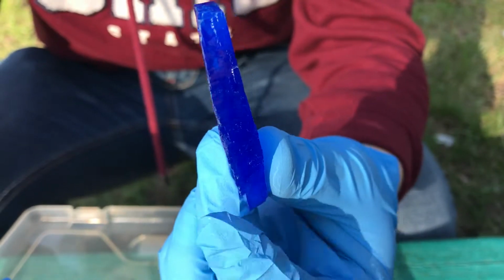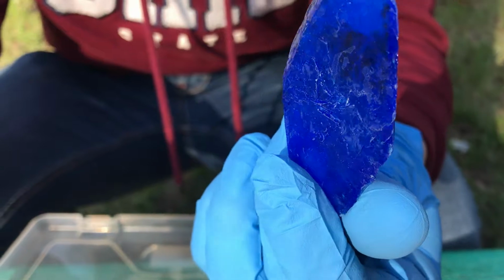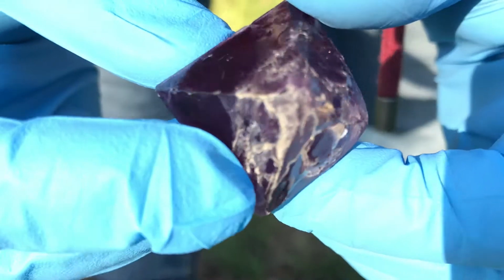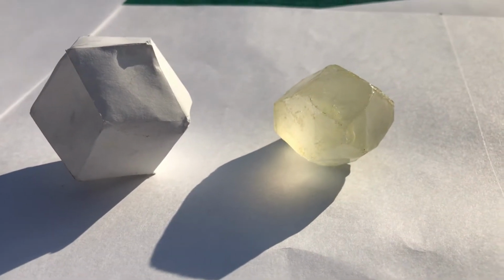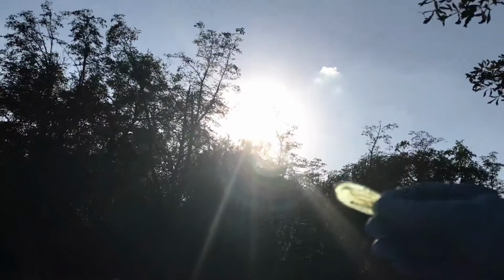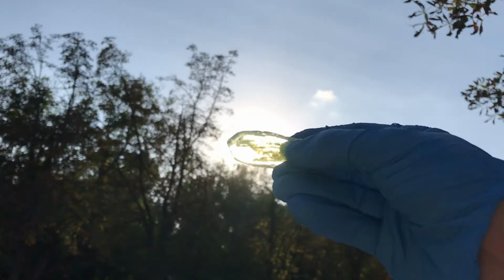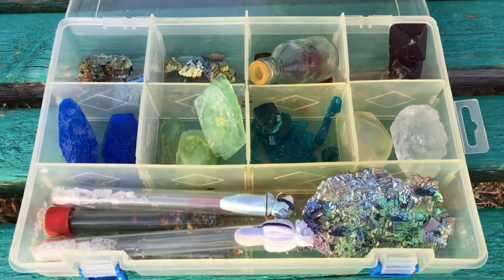Once we have prepared our saturated salt solution, it has to be filtered while it is still hot. Filtering is not required. However, if you buy the chemicals in a garden shop, not in a special shop, the solution must be thoroughly cleaned from possible impurities. I would still recommend to initially use pure chemicals. After the filtration, the glass is left for a few days to let the crystals form.